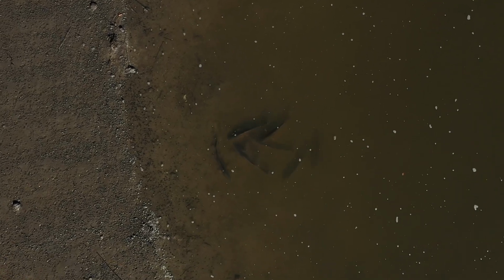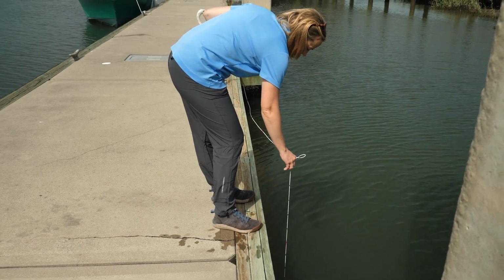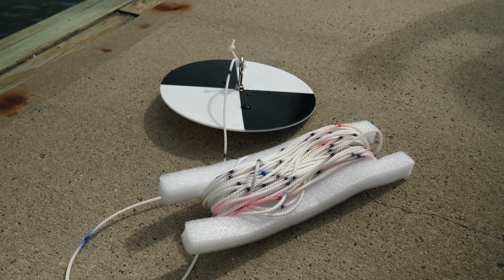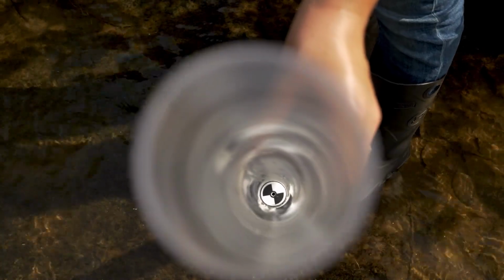your site. South Carolina Adopt-a-Stream measures transparency using two different methods depending on conditions at your site. These methods measure transparency in either meters or in centimeters. For sites that have low flow or are relatively deep, you can use a Secchi disc. For sites that have current or are relatively shallow, use a transparency tube.